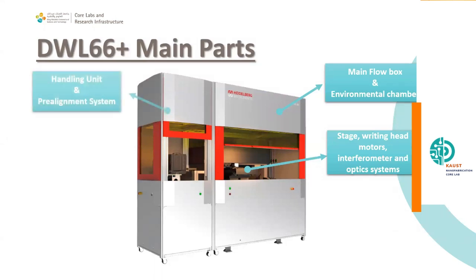Next to it, and this is the new thing that we didn't have before, we have this tower, which is the handling unit and pre-alignment system. Inside of there, we can place cassettes full of samples, either wafers or masks. And we have one arm that brings them from the cassette to the stage, with the pre-alignment system for wafers, aligning them using the flat.